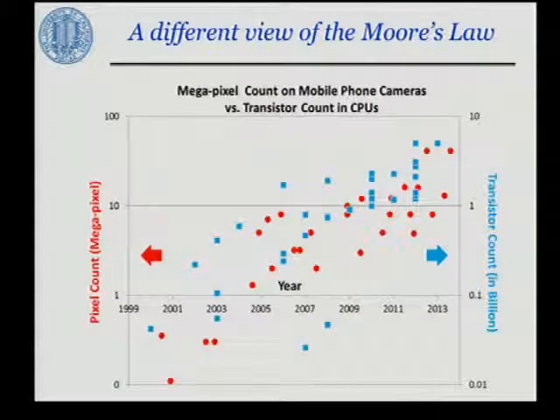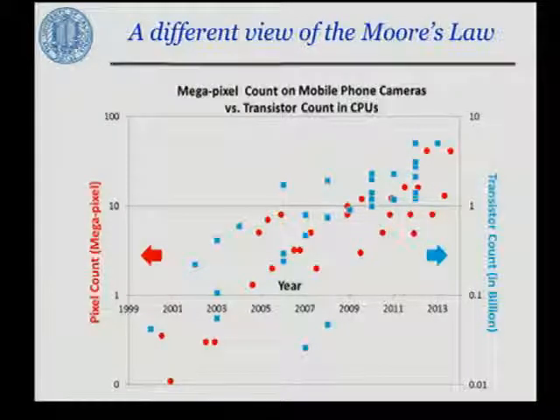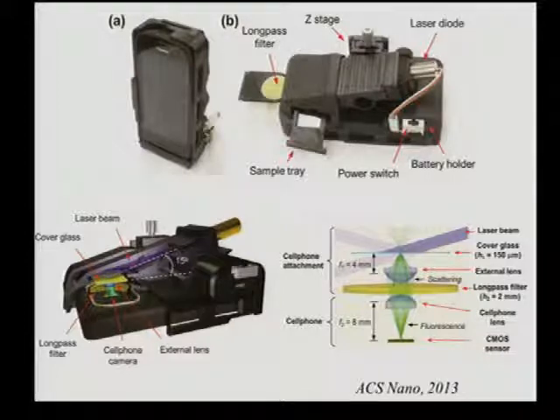I want to share with you a few examples in the other domain, fluorescence microscopy and sensing. Bright field is great, but it has its own limitations, especially when it comes to specificity. Fluorescence microscopy and sensor designs utilize beautiful chemistry at the backbone to bring your imaging system the comfort of the specificity that you bring with surface functionalization or surface chemistry or bioconjugation. And that's where I think fluorescent designs that are also utilizing this kind of a mobile interface would be quite important.